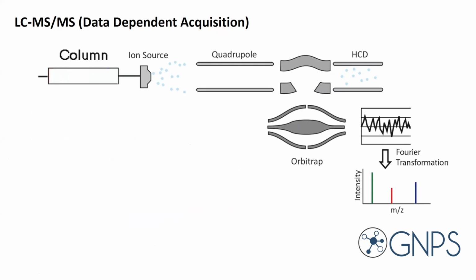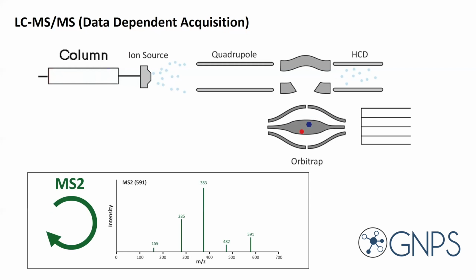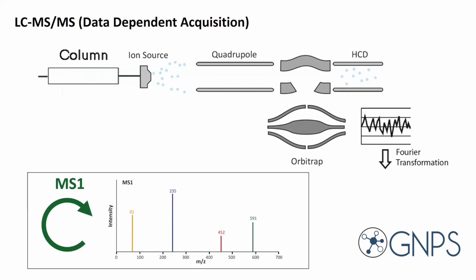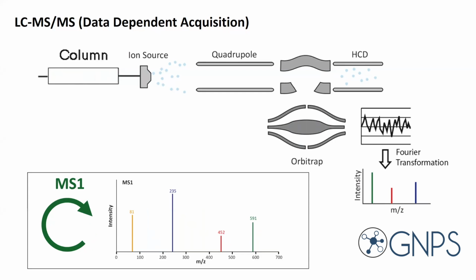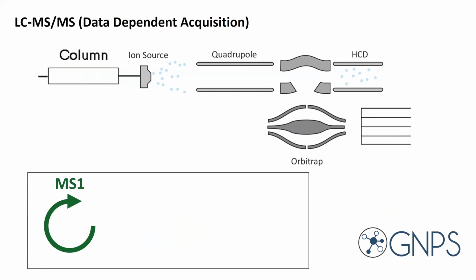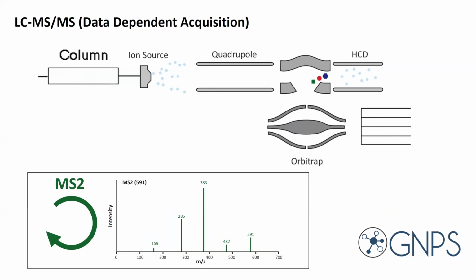And I assume that most of you know how that data was acquired: data-dependent acquisition mode, which is probably the most common MS technique for non-targeted metabolomics right now, where the machine walks through so-called duty cycles. It acquires an MS1 scan, and then based on this information picks the most abundant peaks and acquires MS2 scans in an iterative fashion. In our case, it was a top 5 scan, so we acquired 5 MS2s from a given precursor scan.